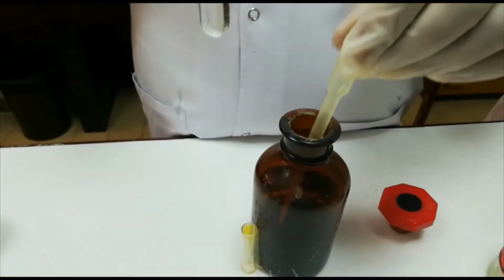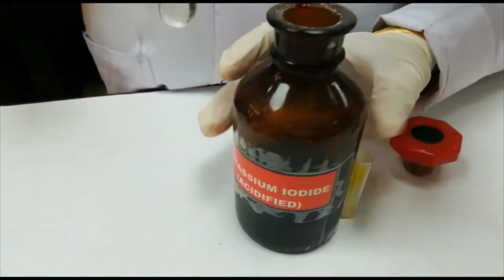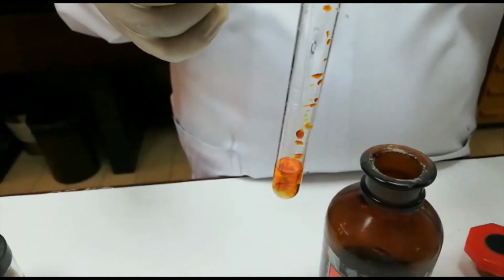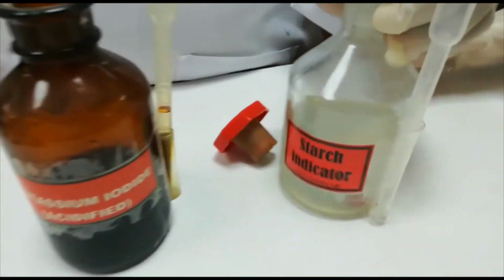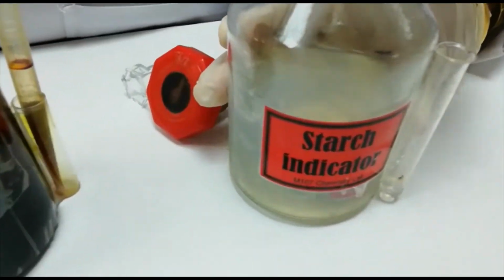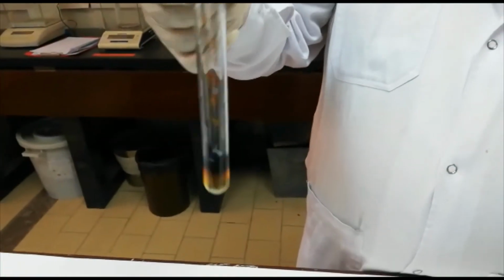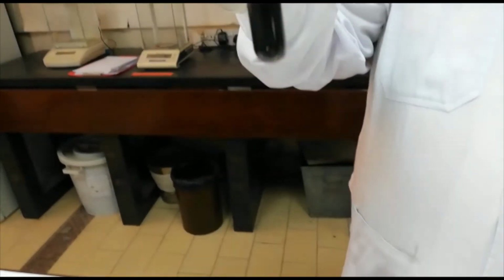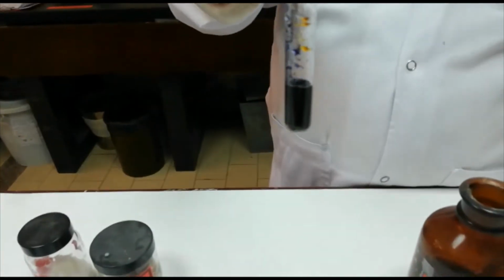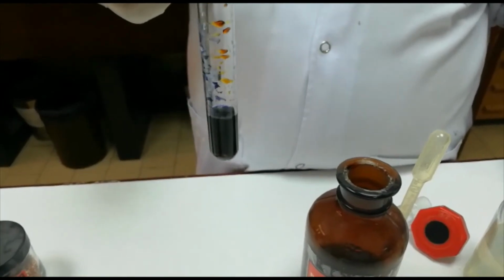The radical is NO2, and the confirmatory test is that if we add acidified potassium iodide and then add starch solution, due to starch you are getting a dark blue color, right? So this will be the confirmatory test. So it is confirmed that the given salt was having nitrite anions.